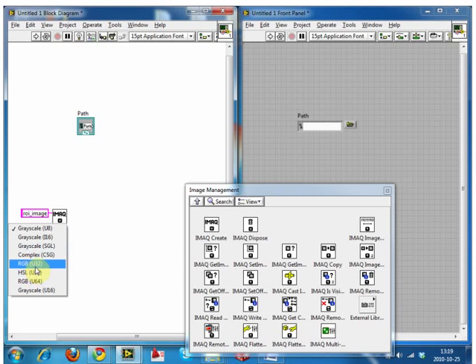U32. If you have the big Andor camera, that has a higher bit depth, so then you would need to use a U16 because that is 16-bit. Which one is that? The fast speed? No, the Andor camera, the single molecule one. Okay, right. So that's a 16-bit detector, and there you would need to use U16. But other than that single example, you'll only be using U8 and U32.